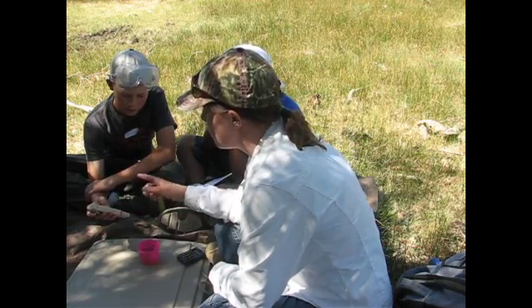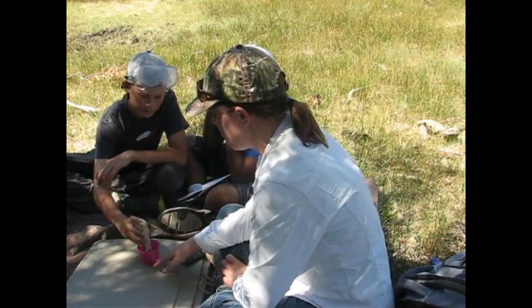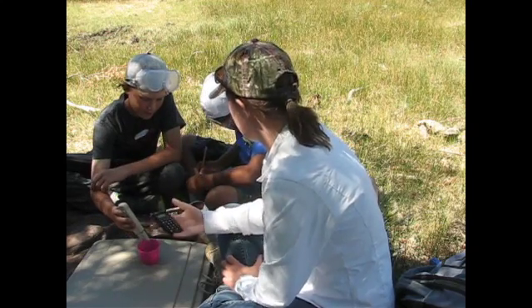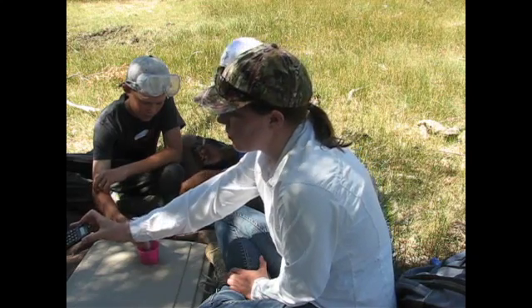So turn it on? You can turn it on and then just stick it in the water and let us know what number you get. 20, okay. So that's our meter reading, which should be your first question. And then I need somebody to multiply.